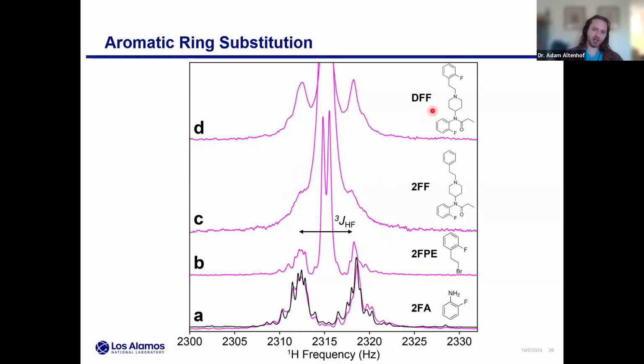Compare that to this difluoro case, where we do have that line-broadened aniline site, but now we have this fluorine, which isn't seeing any nitrogen, and that's giving us the resolution to actually resolve this primitive doublet structure, if you will. Now, in both of these cases, there are many lines that are all overlapped, and you also have to consider the nitrogen relaxing here. But nonetheless, even though the resolution's low, there is still this differentiation between potentially precursors and other types of fentanyl.